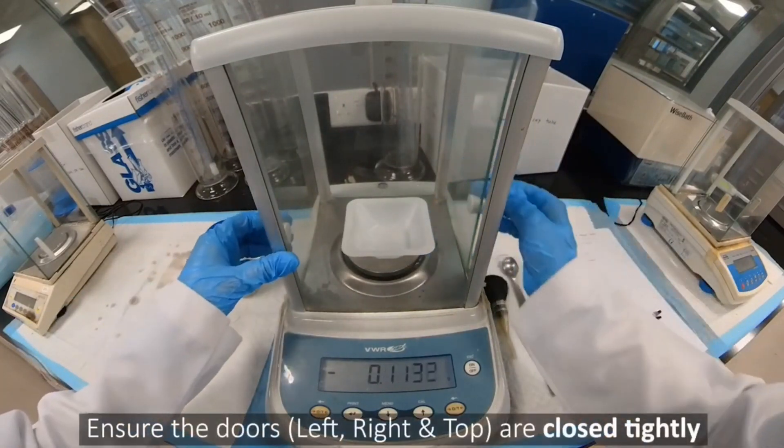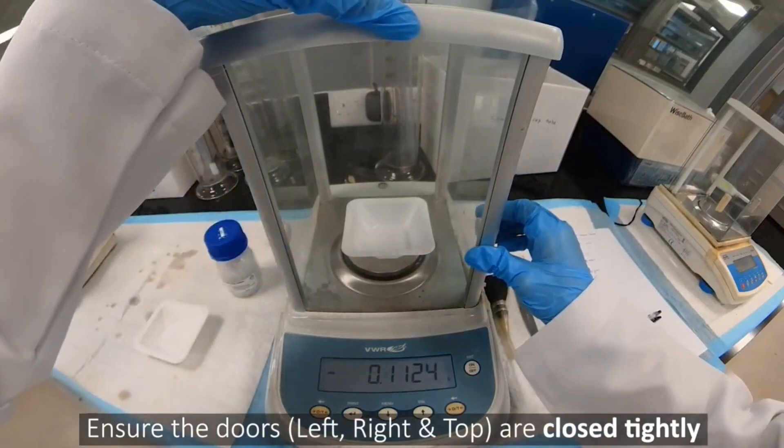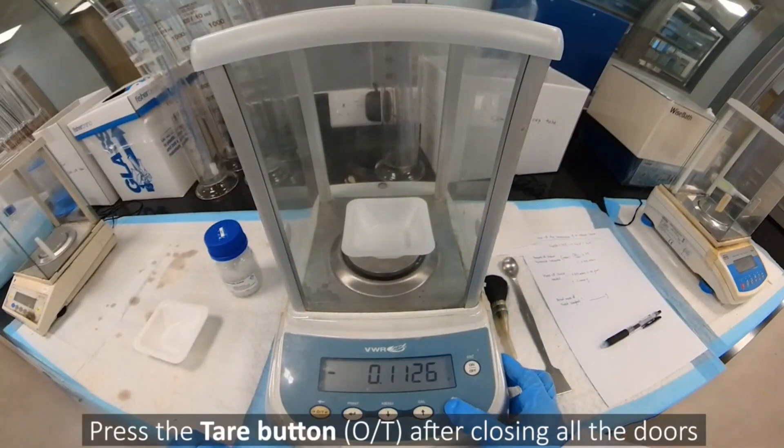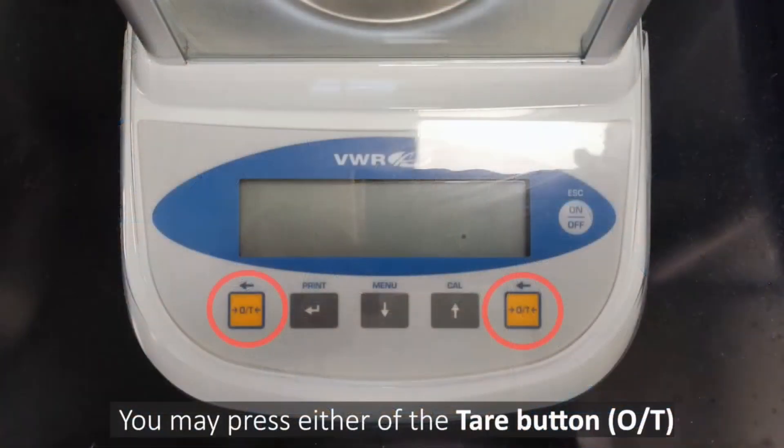Ensure the doors, left, right and top, are closed tightly. Press the tare button after closing all the doors. You may press either one of the tare buttons.